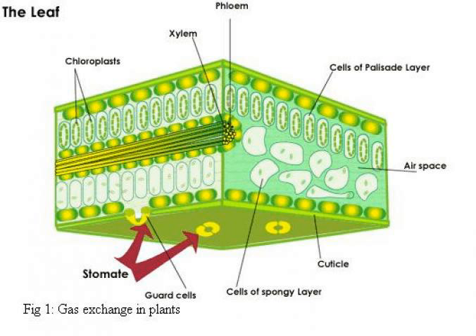The number of stomata on leaf surfaces varies widely among different species of plants. Generally, the lower surface of the leaf tends to have a higher total than the upper. In some leaves, stomata occur in patches. That is, there are areas, usually around veins, that are completely absent of stomata.